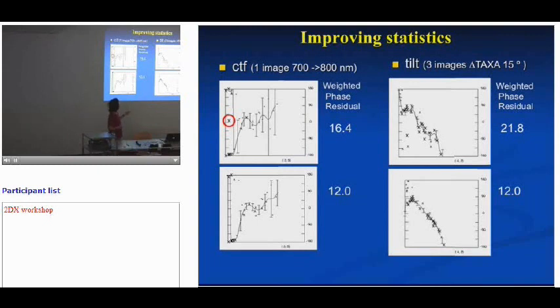So in this case, there are a few of them consistently being off from the others. By going back to Origami tilt, turning on the tilt geometry refinement option, I can get those tilt geometries more correct. Their tilt angles were okay, but the tilt axes were off, something like 15 degrees.